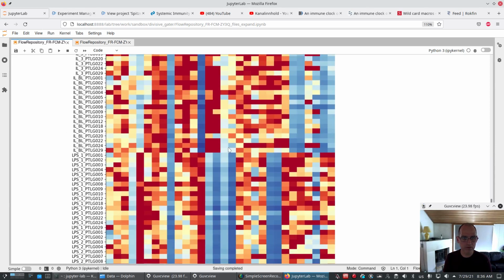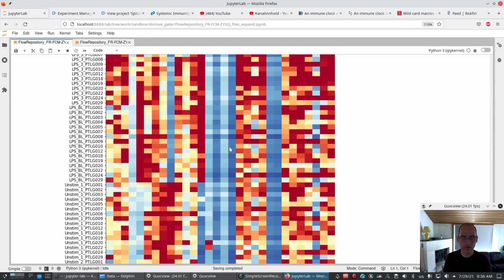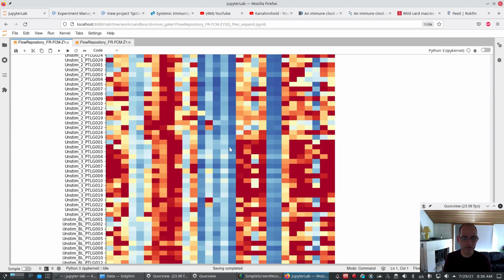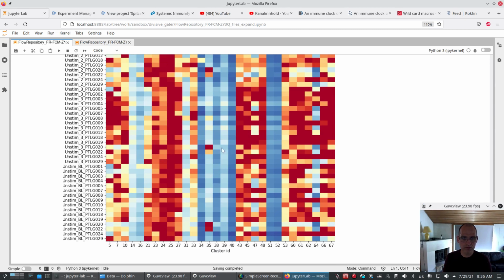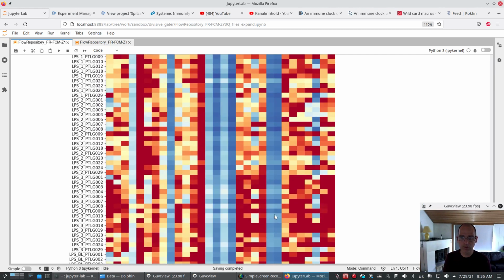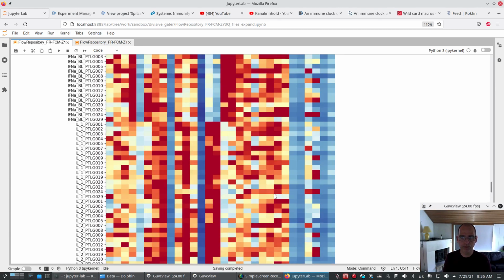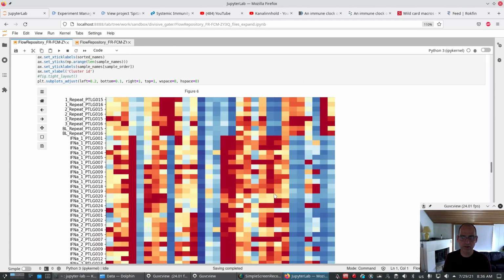But this one also transitions. Not as clearly, but we see that there's a lot of signal in these clusters. So here there's nothing, but we can just go to another one. So let's take this 51, 52. Is there anything to see? Oh yeah, it also shifts somewhere. So there's a lot of pattern here.